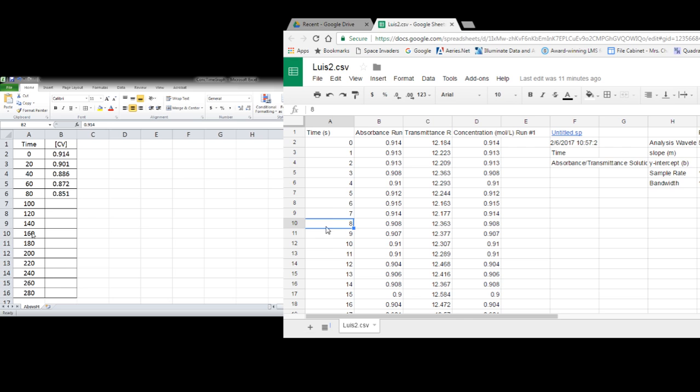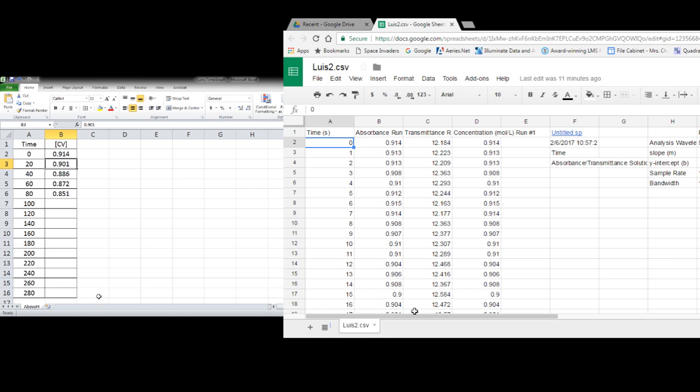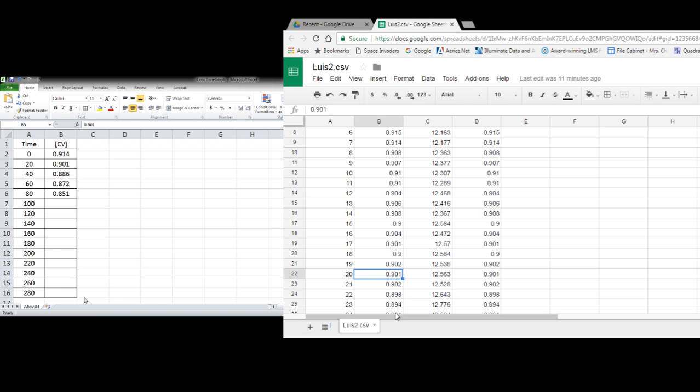So we're going to do every 20 seconds and we'll all do the same thing. You notice I've plugged in some data from every 20 seconds.